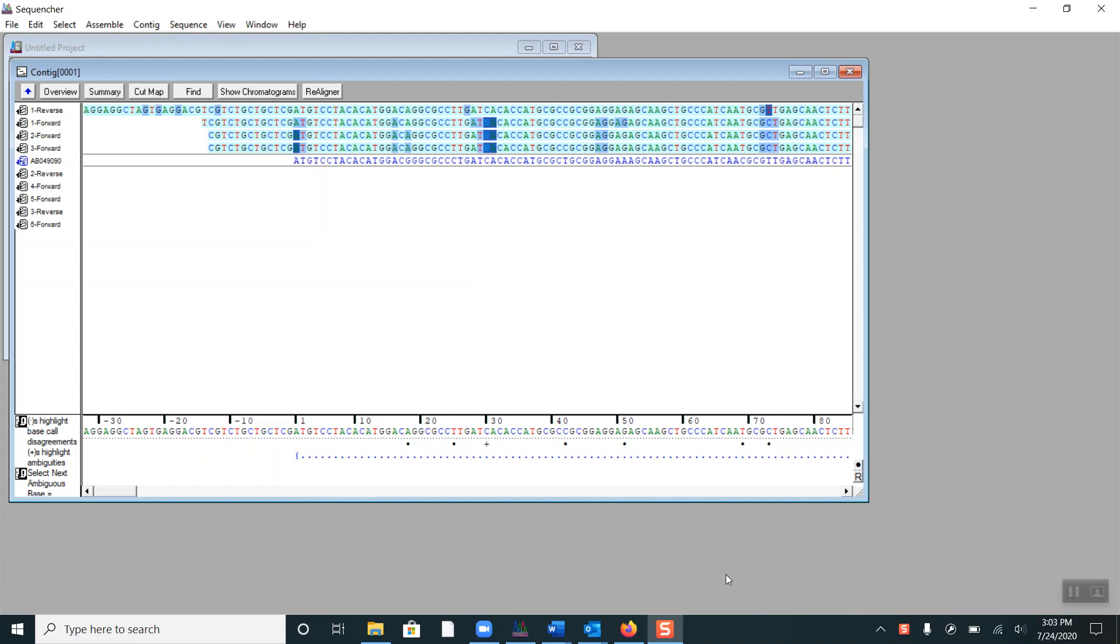A previous tour guide video looked at how to view aligned sequences in Sequencher. Now we will look at how to edit aligned sequences. Here we see the basis view of a contig. As a reminder, you have the fragment names here on the left and the sequences on the right, including the reference sequence here in blue.